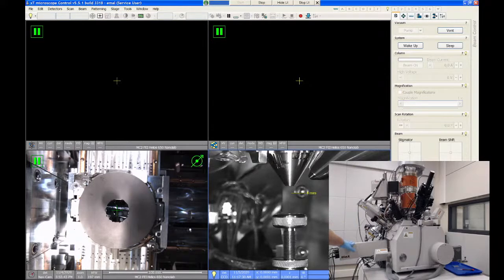This accessory on the left here is called the EBSD camera. That stands for electron backscatter diffraction. This is used to determine the grain orientations in a polycrystalline sample. Probably not very relevant to you guys, just for your specific projects, but for a lot of users, this is a nice accessory to try to find certain grain orientations or just map out the grain orientations in your sample.